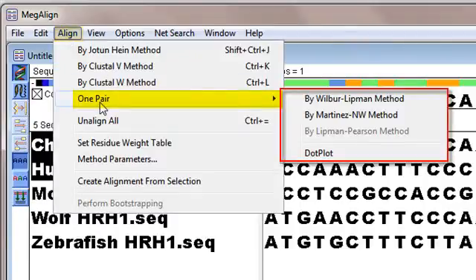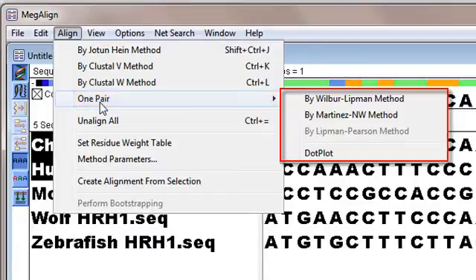Because this project contains only DNA sequences, the Wilbur-Lipman, Martinez-Needleman-Wunsch, and Dotplot methods are enabled.